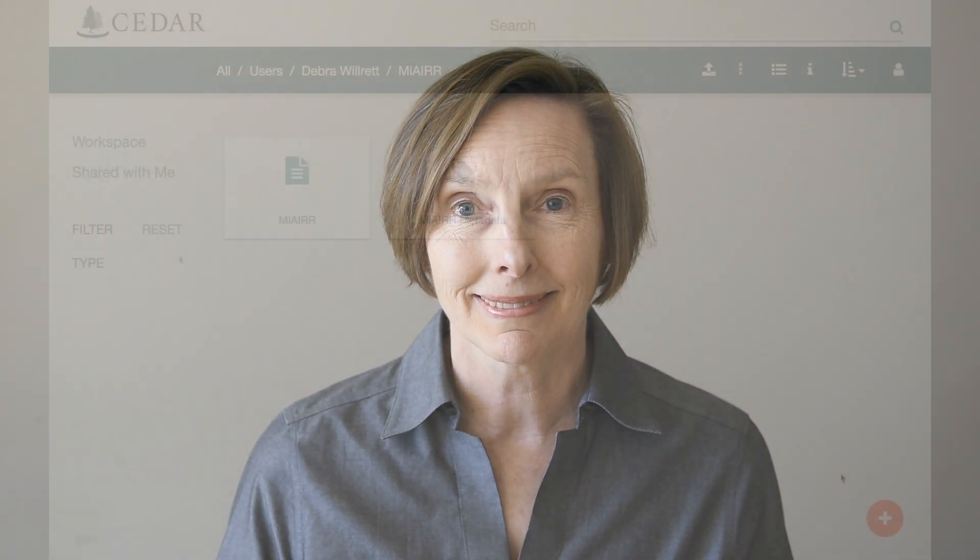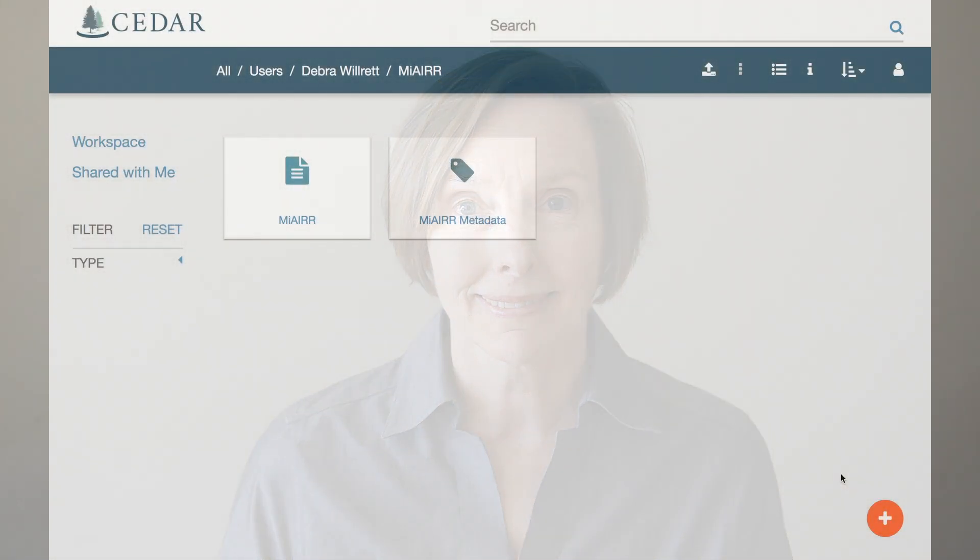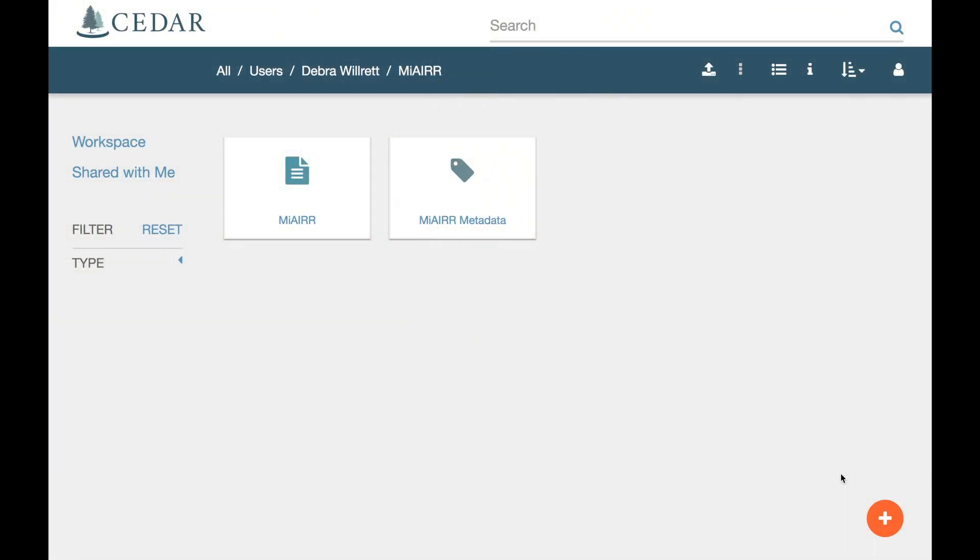We will do a submission using a template created by the Adaptive Immune Receptor Repertoire Community, otherwise known as AIRR, for describing AIRR NGS datasets. The AIRR community has defined a minimal information standard called MiAIRR to describe an AIRR submission and has captured this in a CEDAR template.